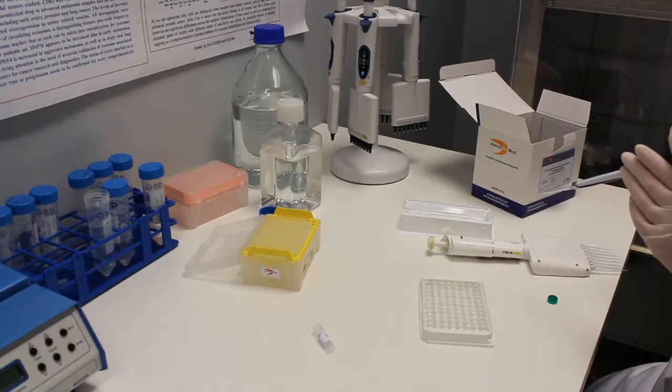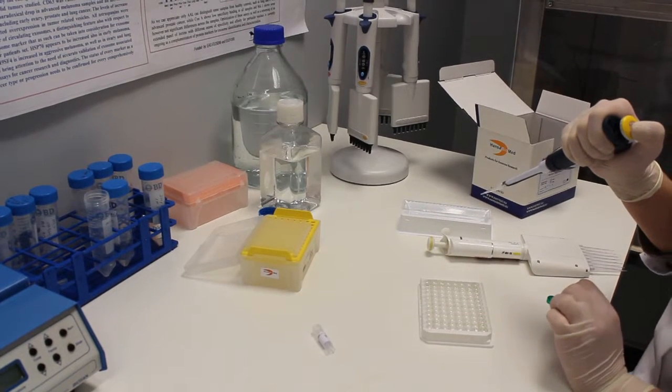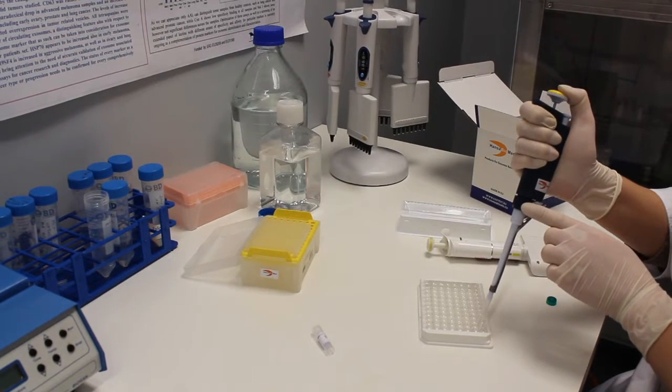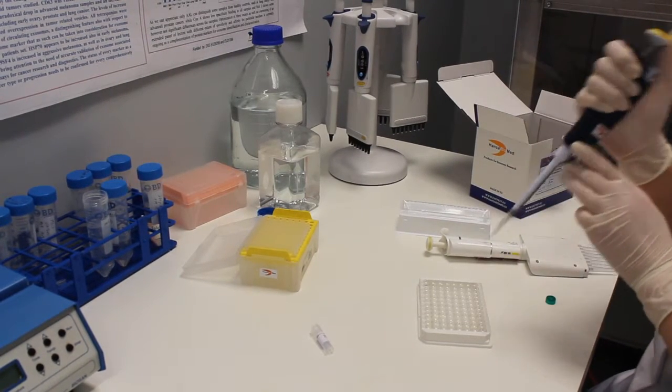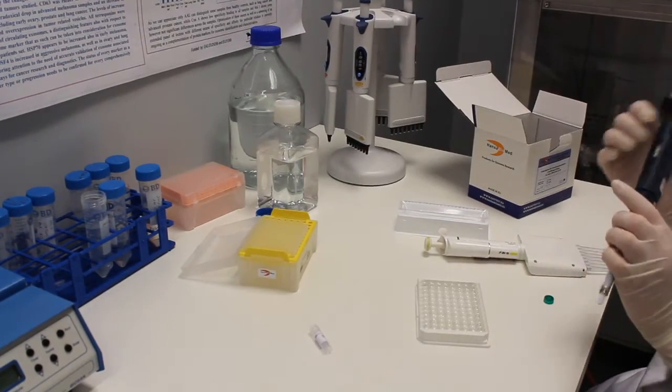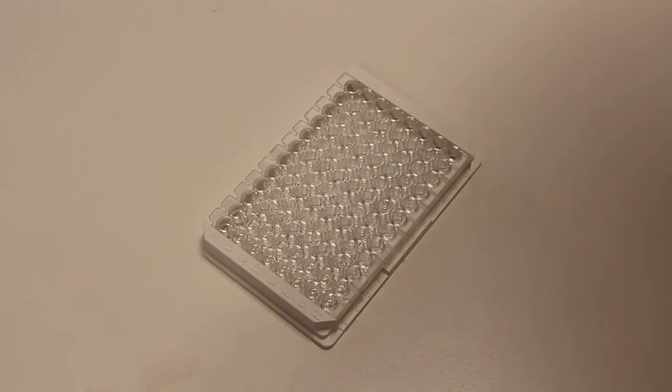After all dilutions in 7th well will remain 200 microliters of sample. Discard 100 microliters from 7th well, so that in all wells was the same volume. Calibration curve is ready. Here you can see the amount of exosomes containing in every well.